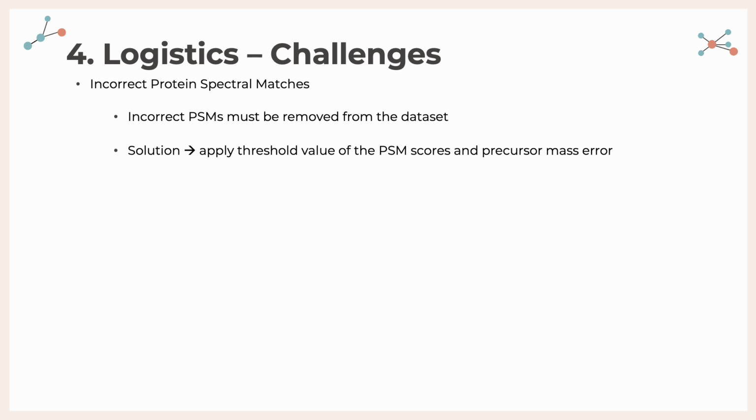You're adding the threshold, say this much, let's say 70 out of 80% similarity, or 70 out of 100% similarity is good enough to be considered a true positive or a positive. It's stuff like that. So you're applying the threshold to just filter out everything that is truly incorrect.